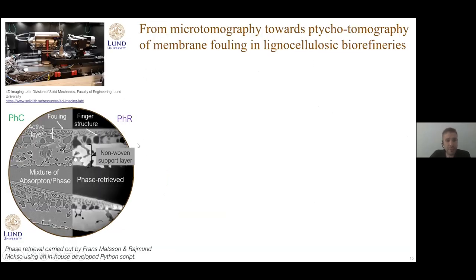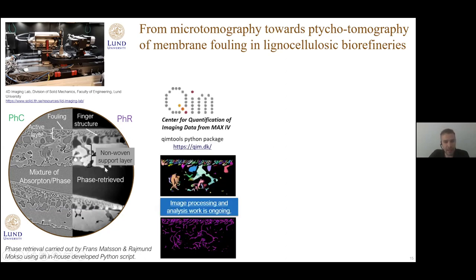We carried out a lot of scans on the lab-based scanner. I can show you the benefit of applying phase retrieval, where you really increase the contrast-to-noise ratio. We can clearly see the difference between different components inside the sample because it's like taking something invisible and making it visible. By applying phase retrieval, it becomes much easier to segment the data, carry on with image processing and image analysis. This is work in progress, and we're using some codes from the QIM initiative.